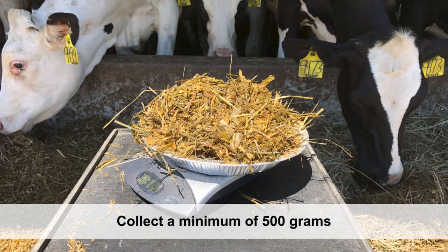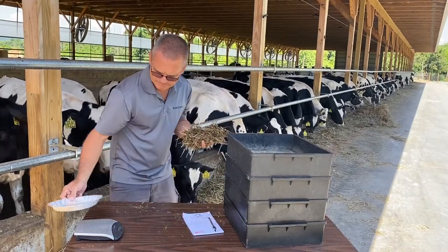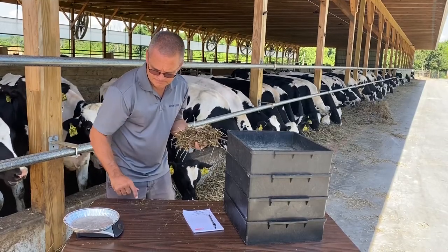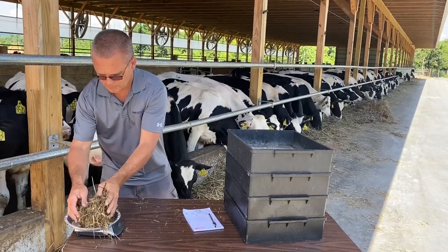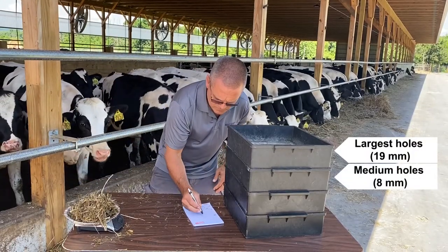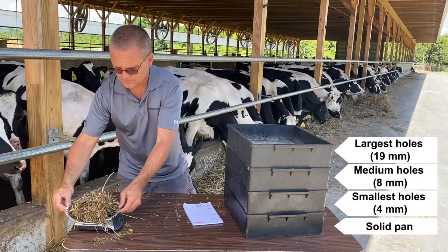Individual forages such as corn silage and haylage can also be analyzed with a PSPS separator. To begin the process, stack the four plastic separator boxes on top of each other in the following order: the sieve with the largest holes on top, the medium-sized holes next, then the smallest holes, and the solid pan on the bottom.